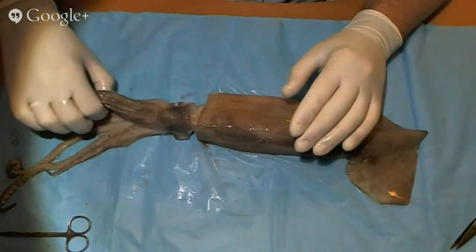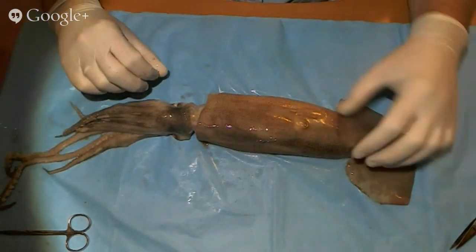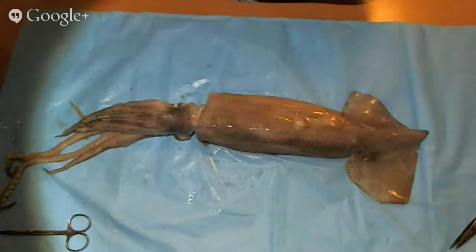All right, so let's have a look at a couple of other features that are on the outside, and then I'll have a look at what's going on inside this.